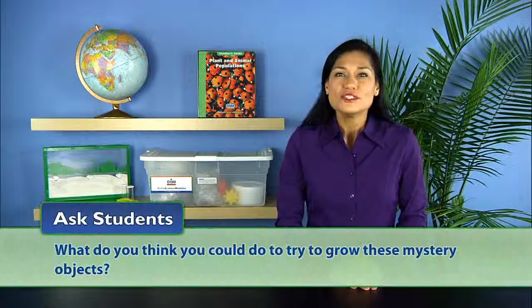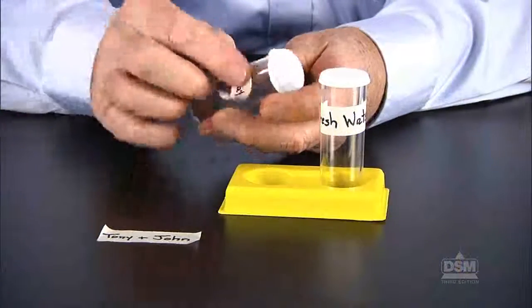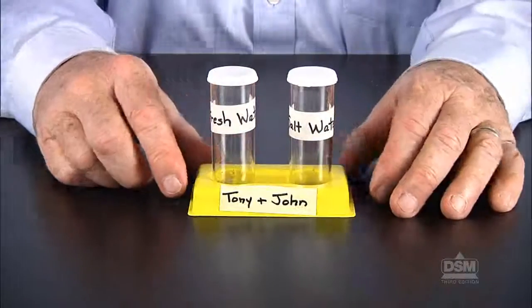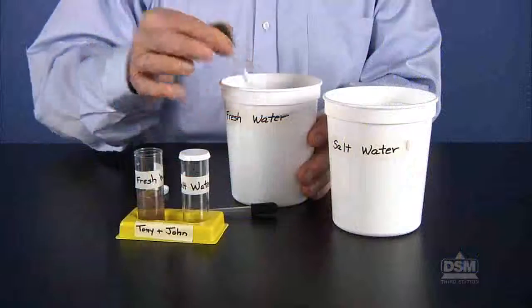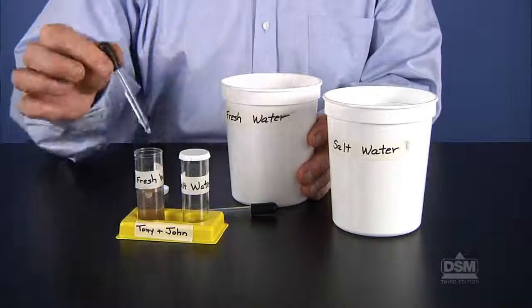Then ask, what do you think you could do to try to grow these mystery objects? Lead students to suggest placing some of the objects in fresh water and some in salt water. Be sure students understand that they need to experiment with both kinds of water. Next, have students label 1 vial fresh, the other vial salt, and their vial holder with their team members' names. Then tell students to carefully remove the caps from the vials and fill one of the vials 3/4 full of salt water and the other vial 3/4 full of fresh water.